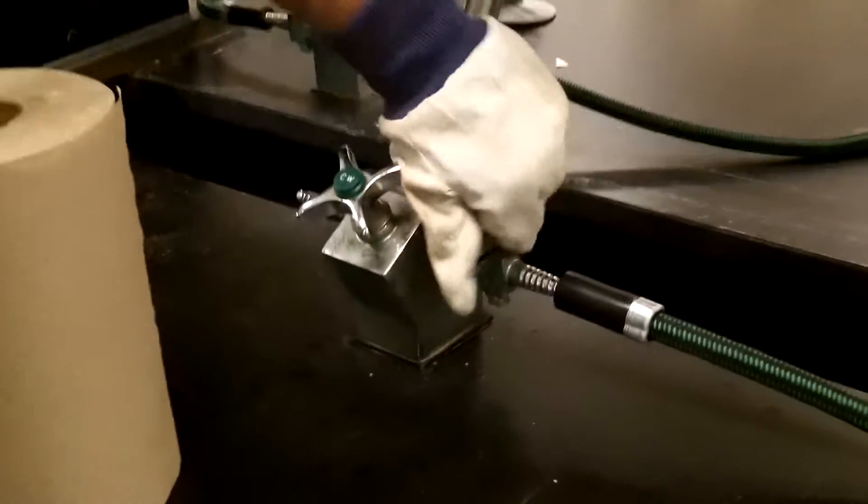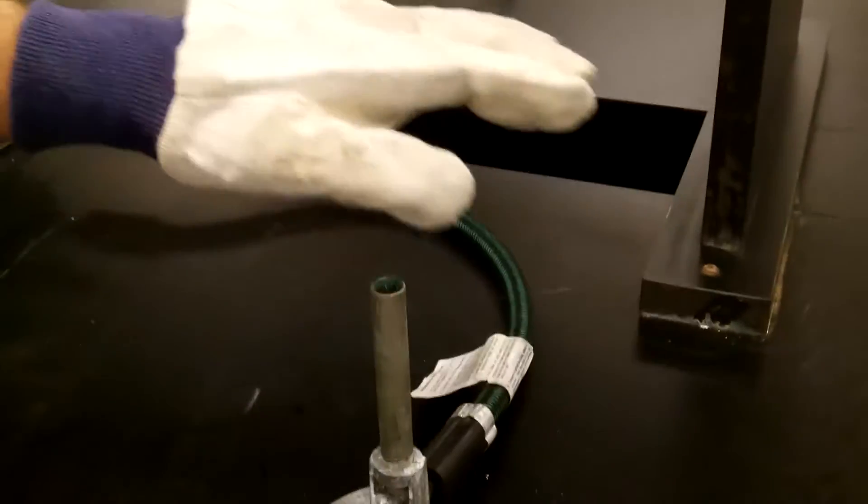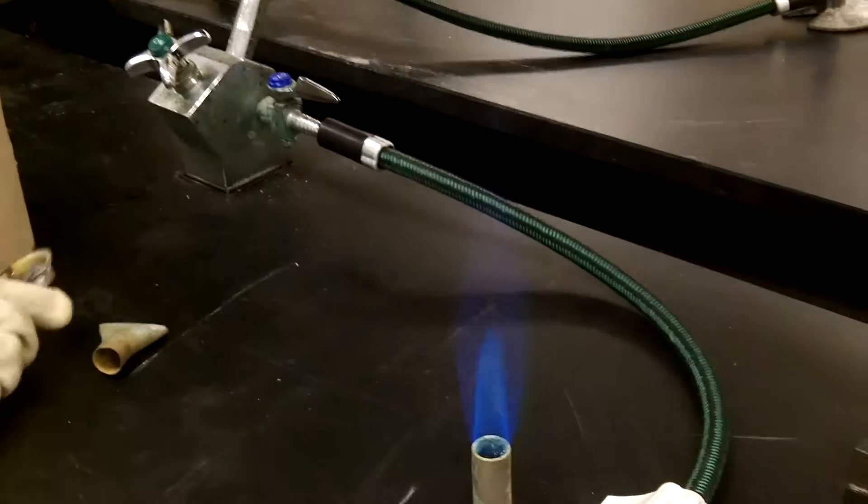Next, turn on the gas to the Bunsen burner. Make sure that there is gas coming out, and then light it with a striker.